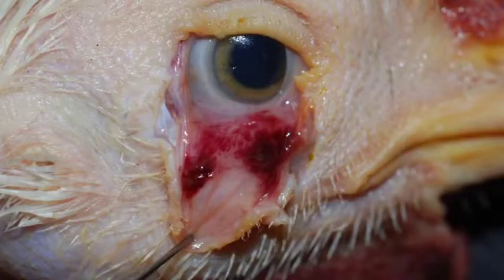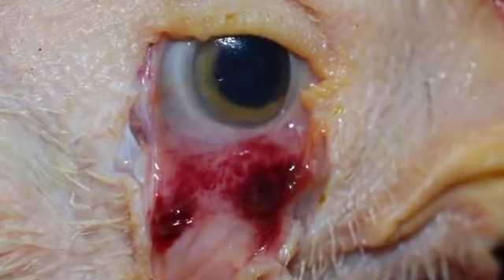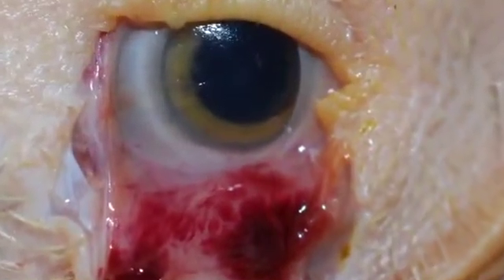Embedded in the mucosal surface of the conjunctiva are aggregates of lymphoid tissue. These aggregates are generally not visible on gross necropsy, but may swell or become reddened during disease.